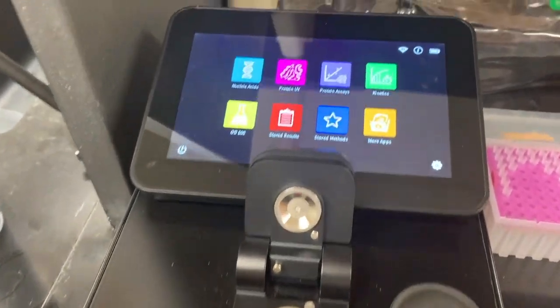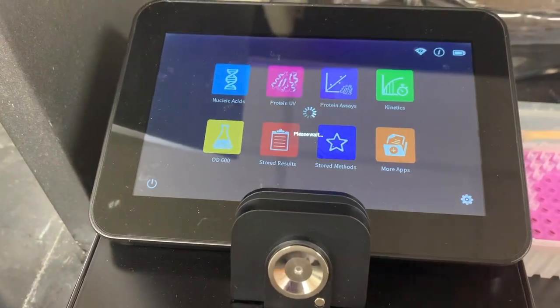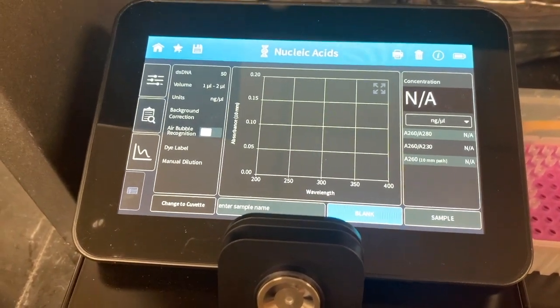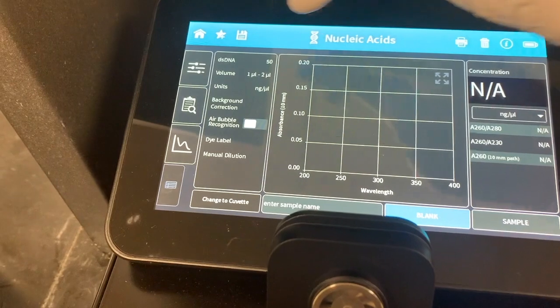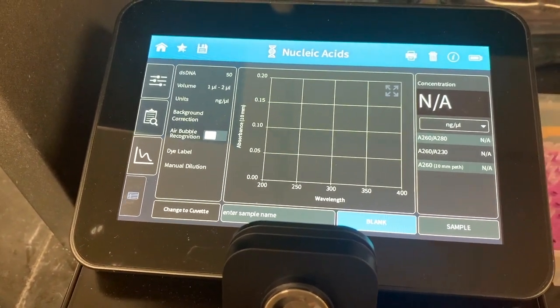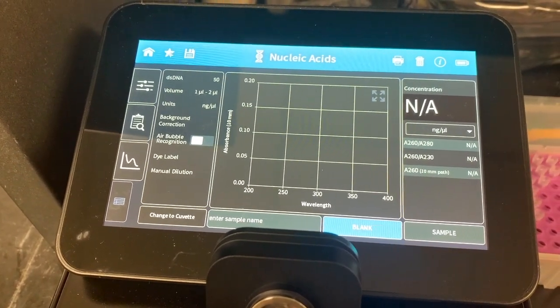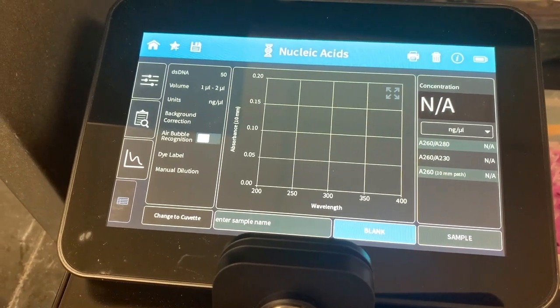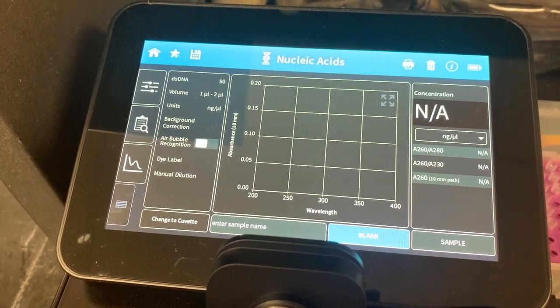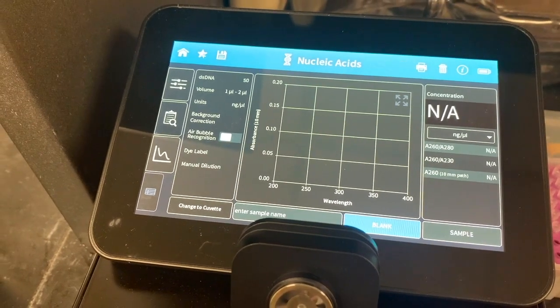And the next thing you're going to do is choose your method. We're going to use nucleic acids. And it's going to give you an image like this. At the very top it will say double-stranded DNA, which is what I'm going to be taking the concentration of, but you can change that by touching it if you are trying to quantify another type of nucleic acid. As it says, you can add 1 to 2 microliters, and it will give you the concentration in nanograms per microliter. Before you add your sample, you need to add a blank.